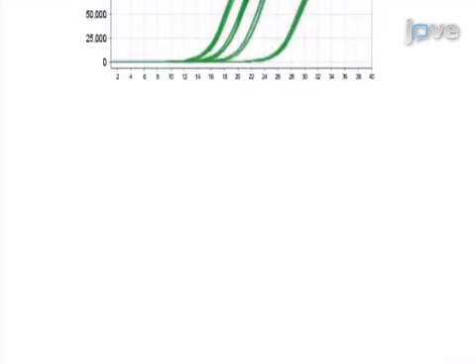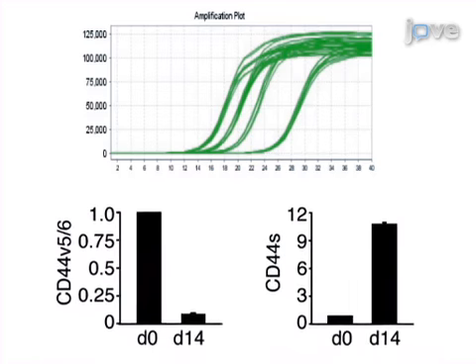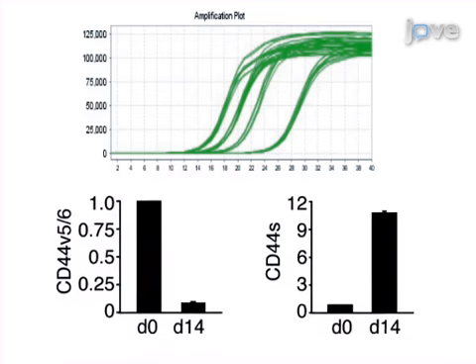Results are obtained that show changes in alternative splicing in genes of interest during EMT based on quantitative RT-PCR and immunoblotting analyses.